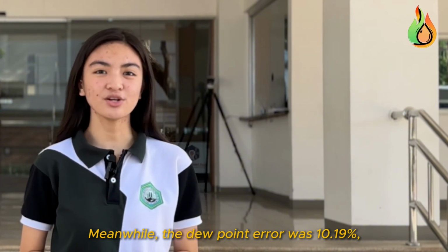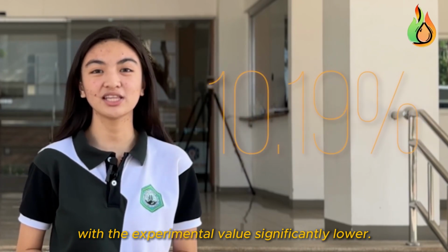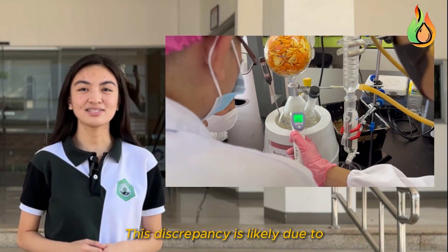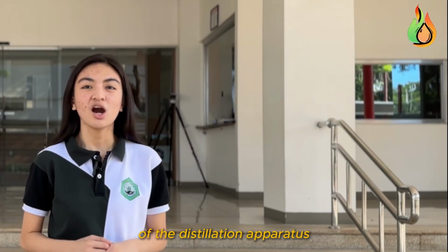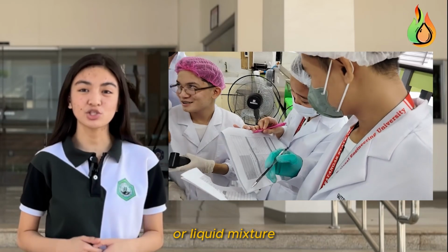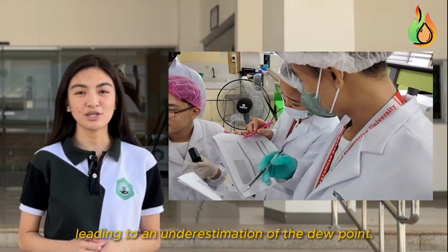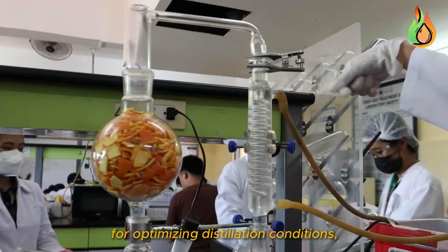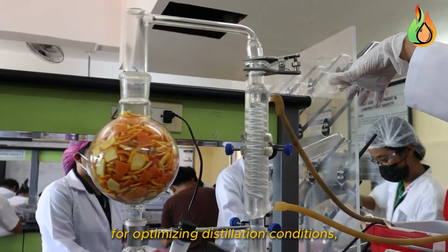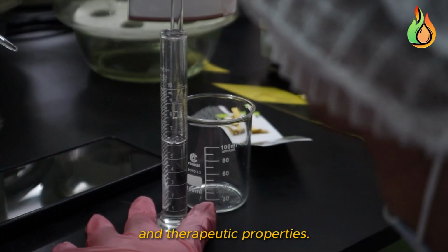Meanwhile, the dew point error was 10.19%, with the experimental value significantly lower. This discrepancy is likely due to the infrared thermometer measuring the surface temperature of the distillation apparatus or liquid mixture, rather than the actual vapor temperature, leading to an underestimation of the dew point. Understanding these points is crucial for optimizing distillation conditions, ensuring maximum yield while preserving its aromatic and therapeutic properties.